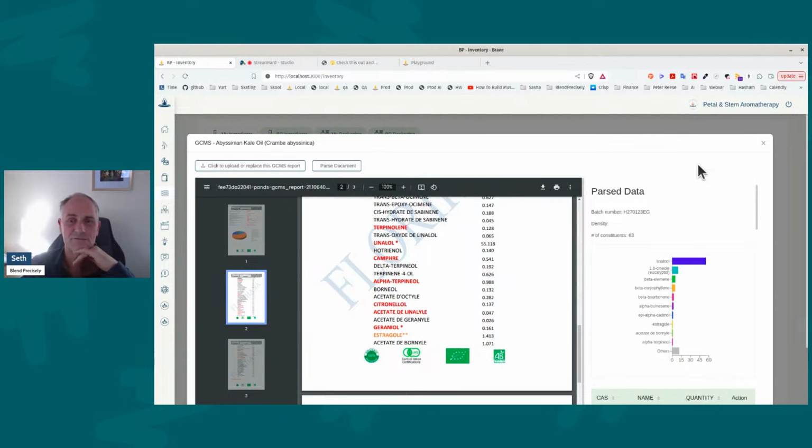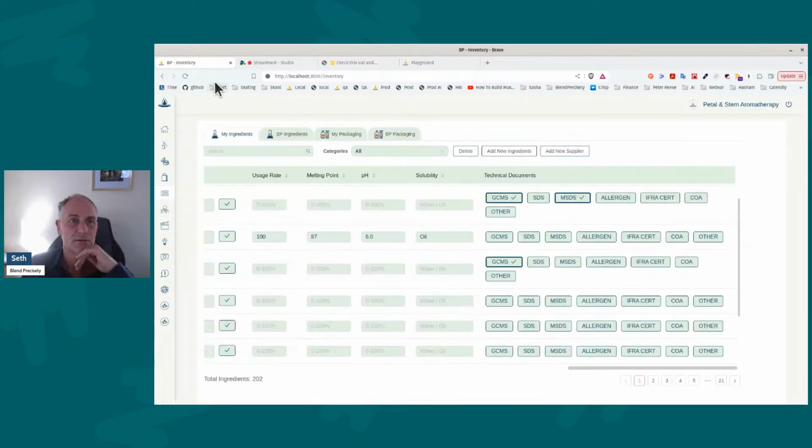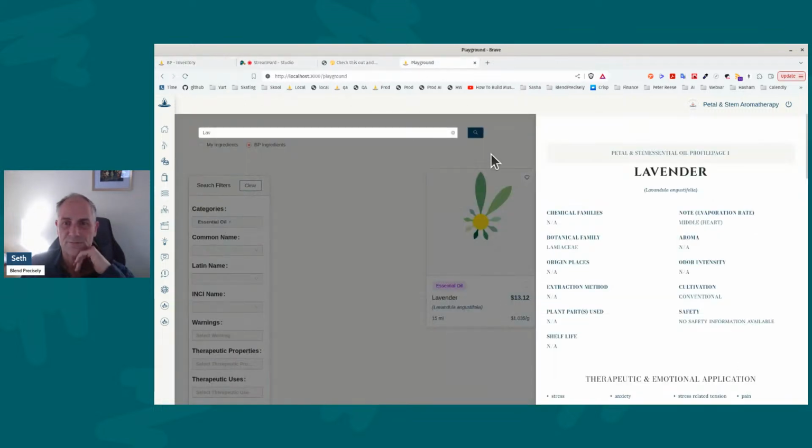Okay, so enough of that. We'll be putting in some more information in here that is typically found in these documents, like the extraction mode and production date and other things that might be interesting too. All right, so back to the playground.